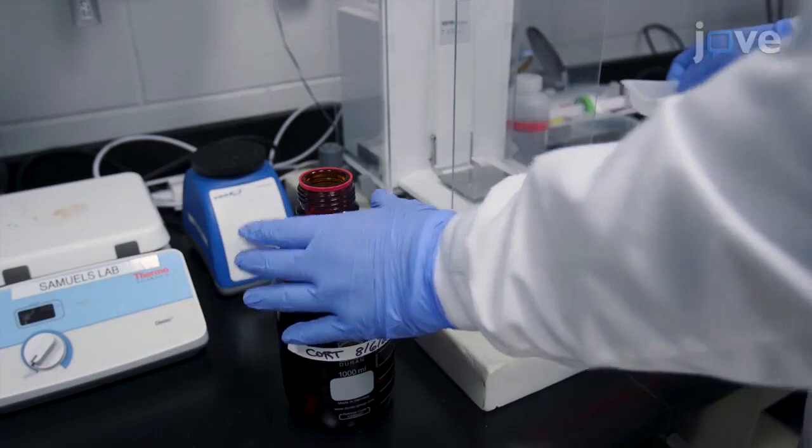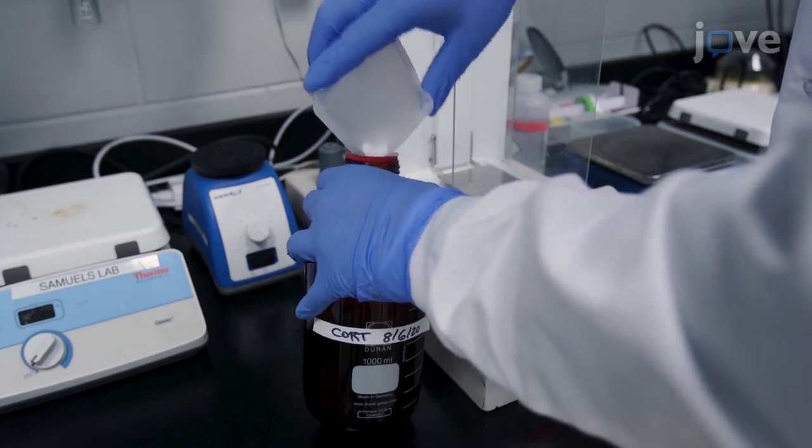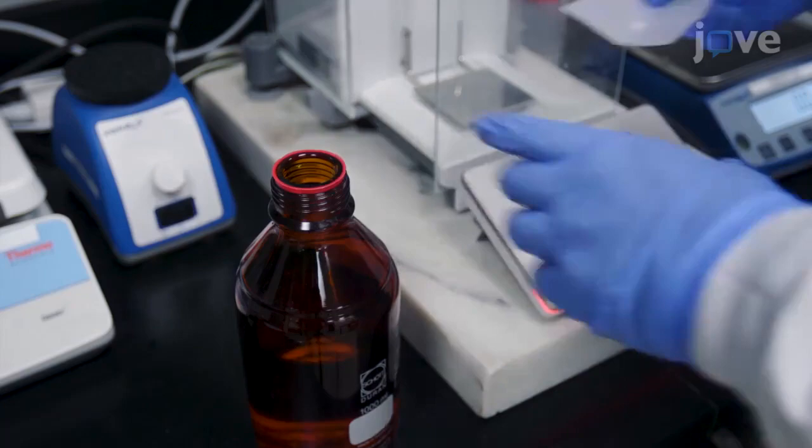To prepare the corticosterone solution, dissolve 3.375 grams of beta-cyclodextrin in 750 milliliters of tap water, followed by the addition of 26.25 milligrams of corticosterone.